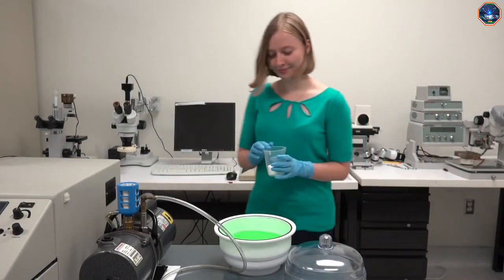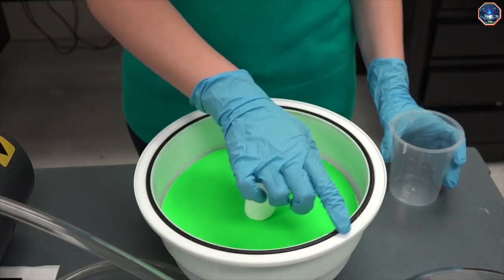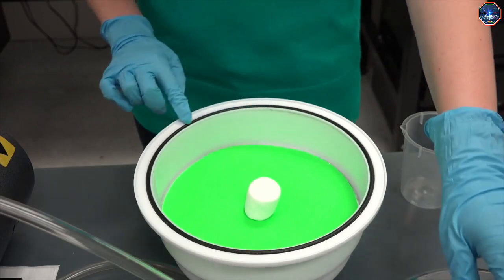I'm now in the sample prep lab outside of the clean room. We have put a marshmallow into the chamber because it will expand as the pressure in the chamber drops. This will enable us to see how the pressure is changing in the chamber as we pump the chamber with the mechanical pump. The chamber needs to be sealed so that air cannot get in when we pump it down and remove the air. Here is the O-ring gasket that seals the chamber.